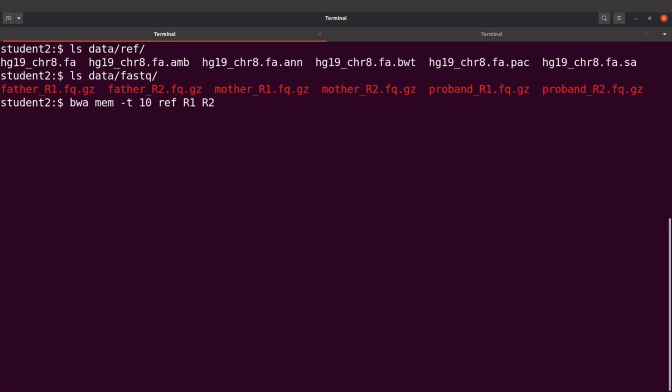You can generate your SAM file, or you can proceed to sort the reads straight away. So in this tutorial, what I'm going to do is a one-liner command to map the reads and also sort the alignment records for us. But in principle, you can also change it and just use the unsorted. That's also fine. Okay, so let's proceed.